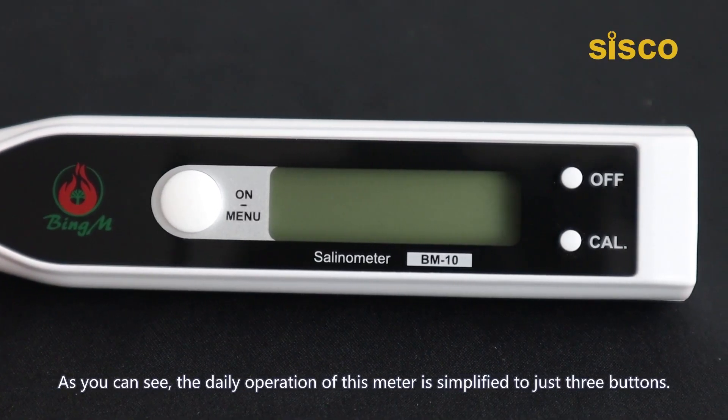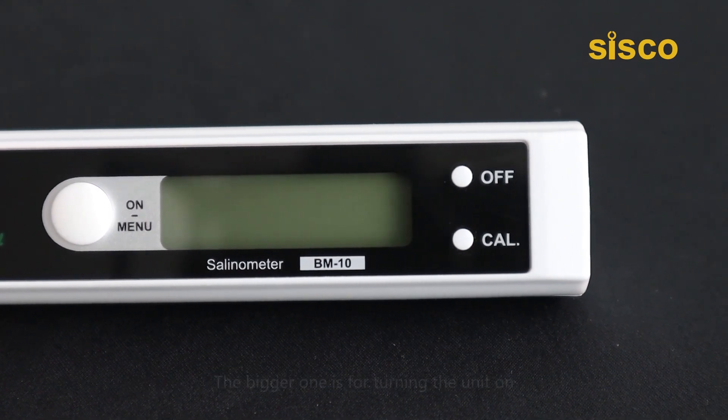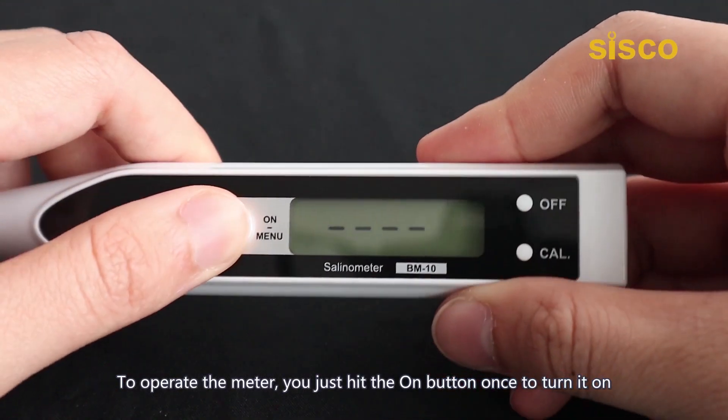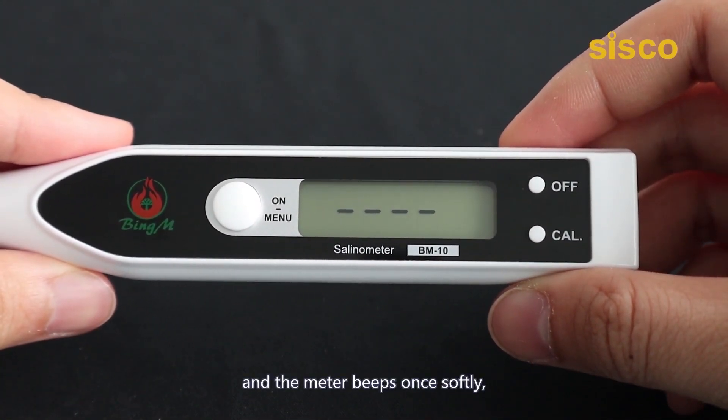As you can see, the daily operation of this meter is simplified to just three buttons. The bigger one is for turning the unit on, while the other two are used to turn it off and to enter the calibration mode respectively. To operate the meter, you just hit the on button once to turn it on, and the meter beeps once softly.